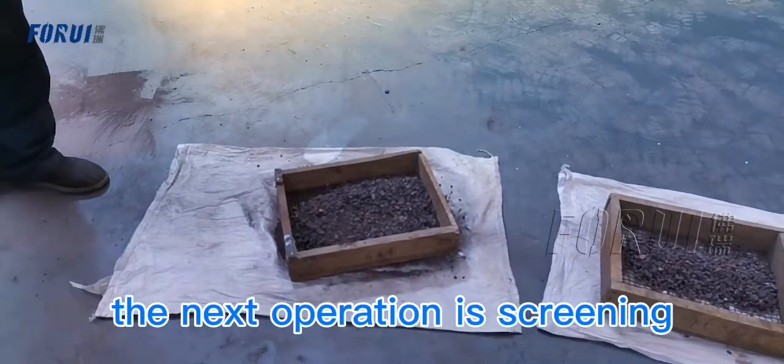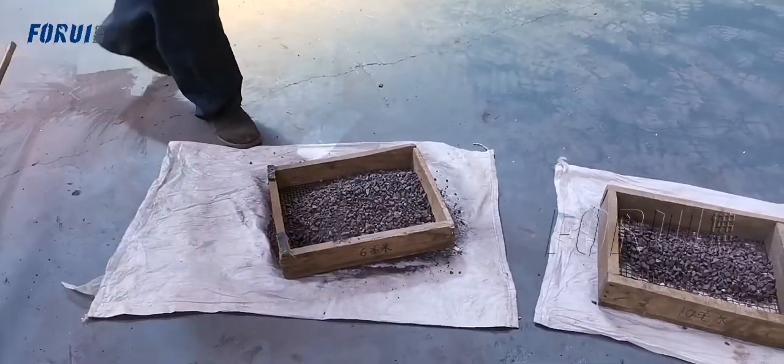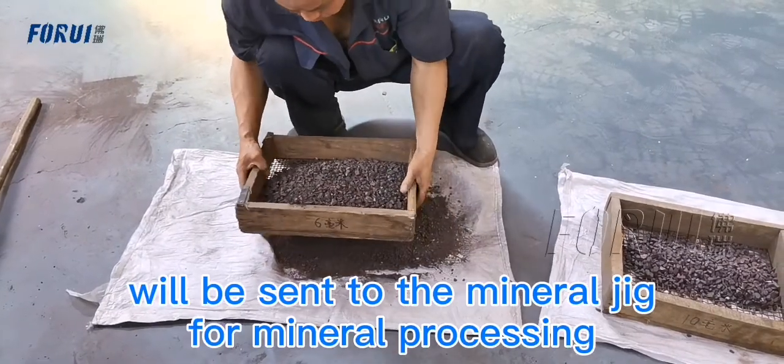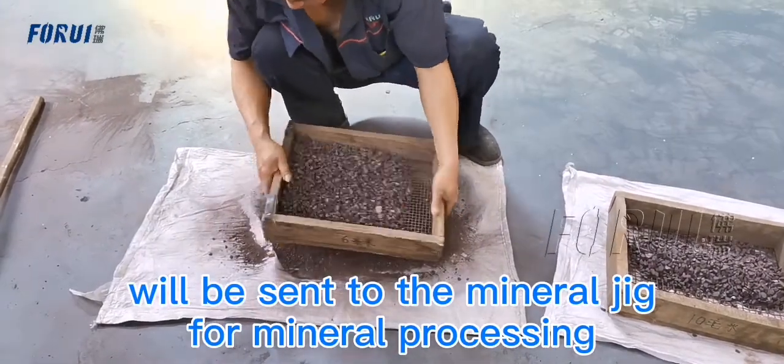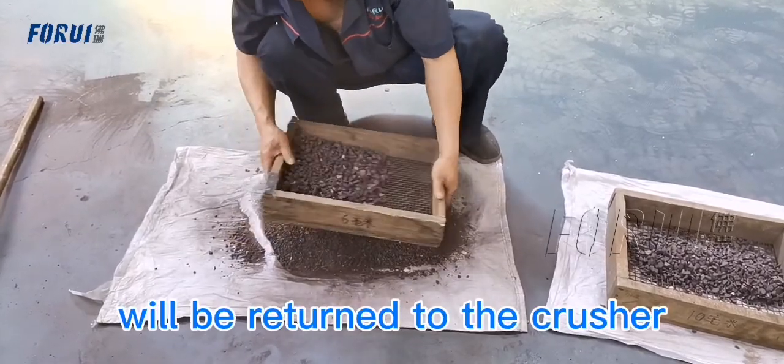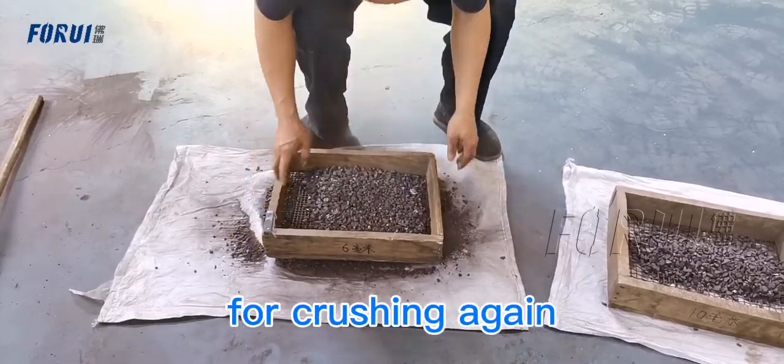The next operation is screening. The undersized product will be sent to the mineral jig for mineral processing, and the oversized product will be returned to the crusher for crushing again.